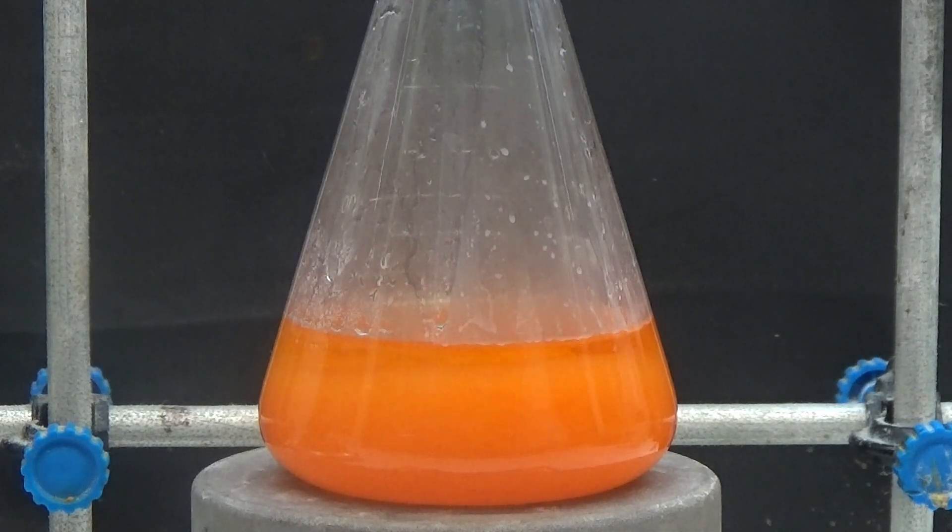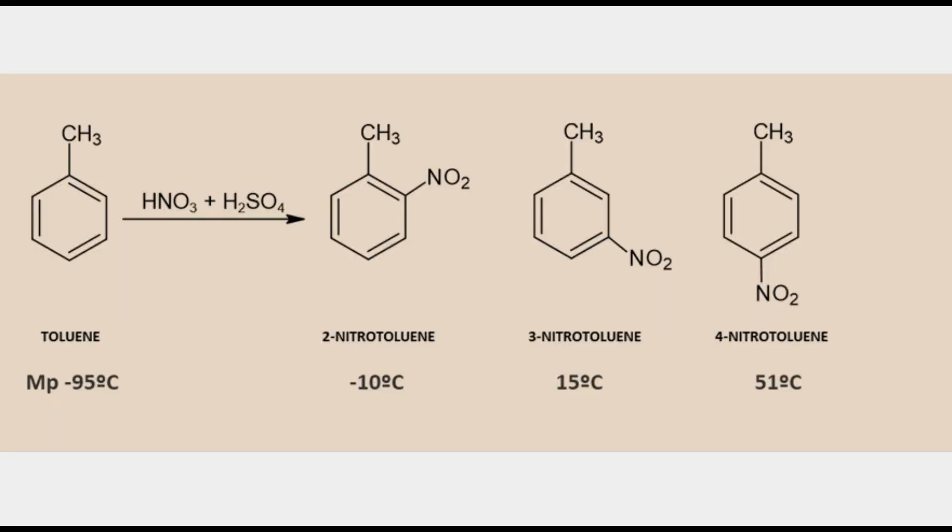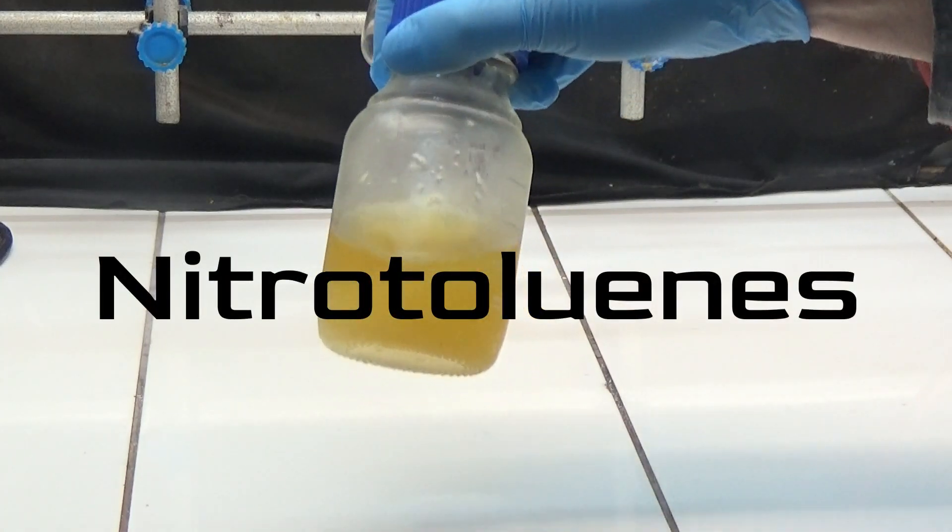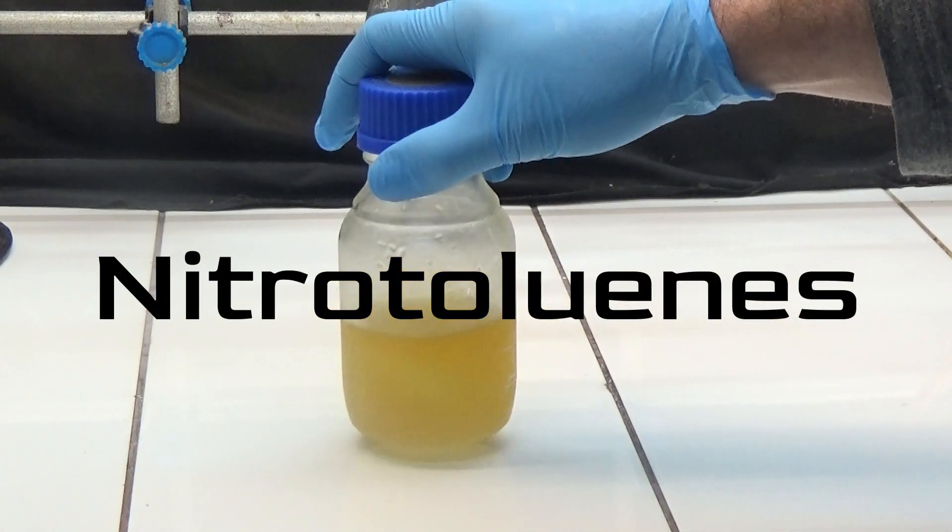After nitrating the toluene and washing it, several isomers have been obtained. These isomers have different melting points. The one I am interested in is orthonitrotoluene which has a melting point of 10 degrees below zero.